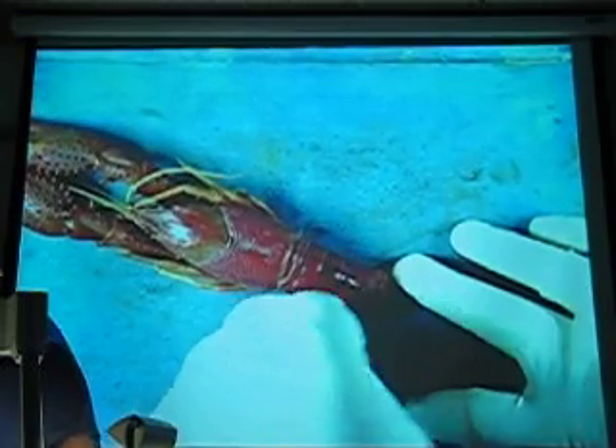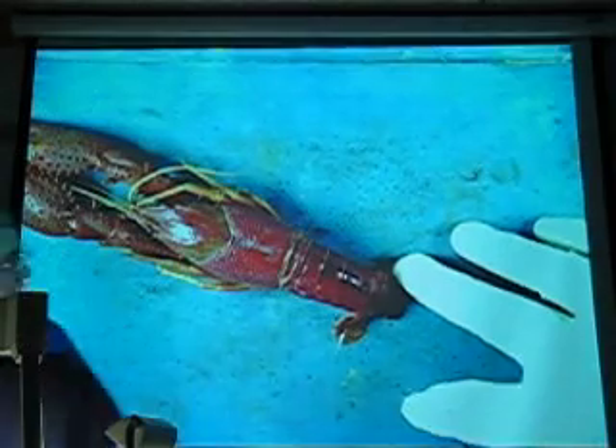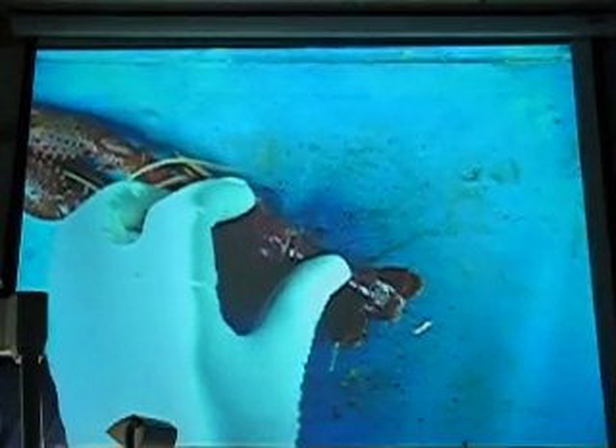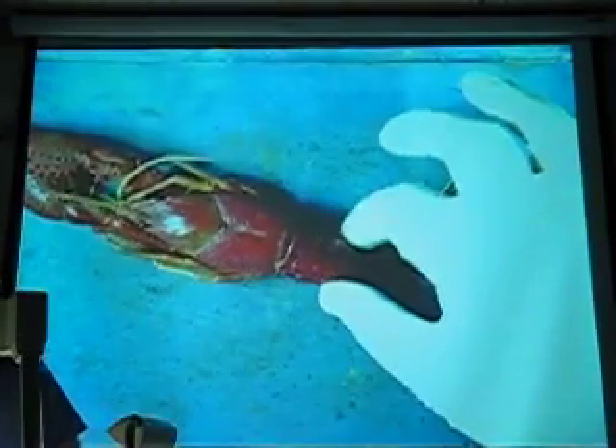Periopods. What I just poked through. Uropod. Uropod. And then — telson. What's that other one? Telson. Telson. What section of the body is this one right here? Abdomen.